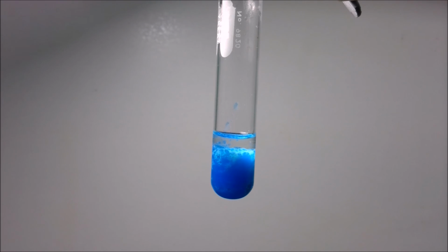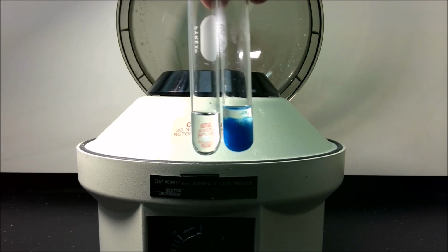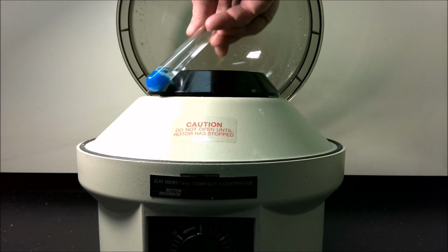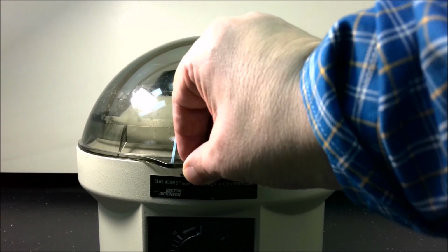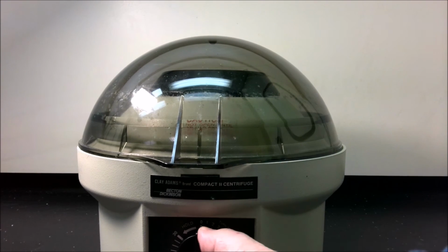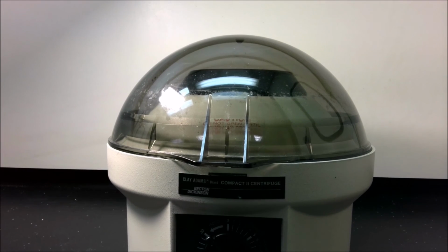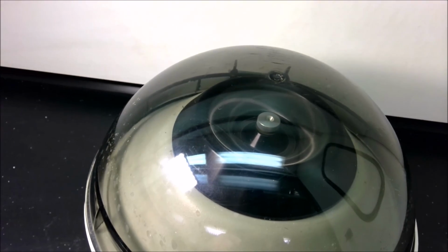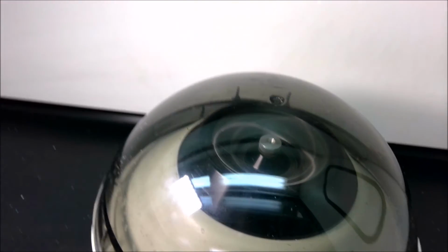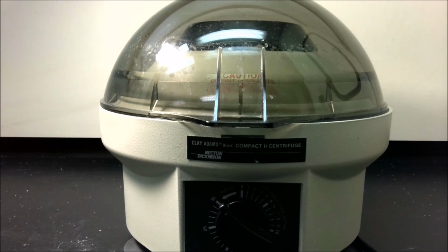When using a centrifuge, it's important to make sure that the centrifuge is balanced. Opposite the sample tube, we're going to place a second tube that's filled with water to about the same volume. Place it inside the centrifuge on opposite sides of the rotor, and we turn it on. Looking at the top of the centrifuge, we see that it is spinning extremely rapidly. This is creating a centrifugal force to separate the solid from the liquid.